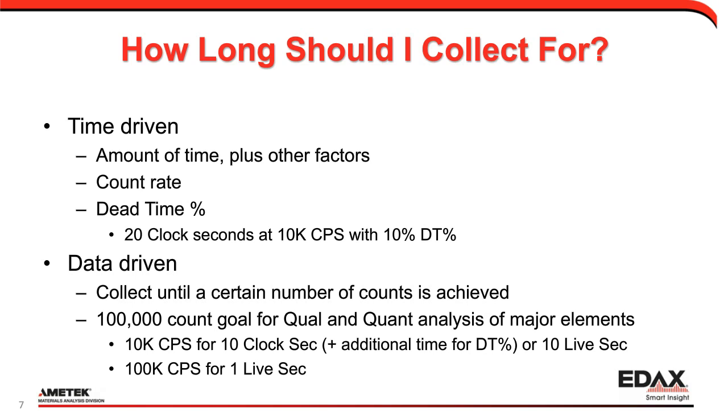But now I'm proposing that we take a more data-driven approach. This is something that one of my colleagues, Pat, and I have talked about for a while. In fact, if you go to our website, you can find some of our materials on data-driven approaches. We have a termination criteria for map collection, which is very similar. What this means is that we collect our data until a certain number of counts is achieved. We're not quoting a collection time per se, but we're saying, collect until you achieve 100,000 total counts in your spectrum.